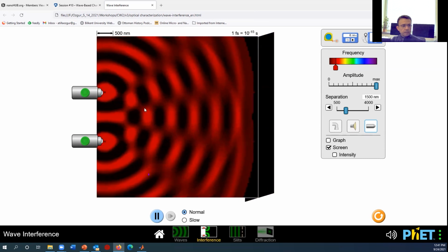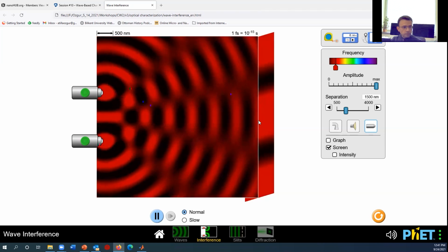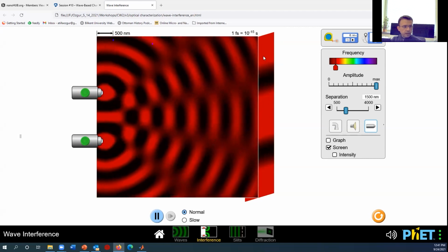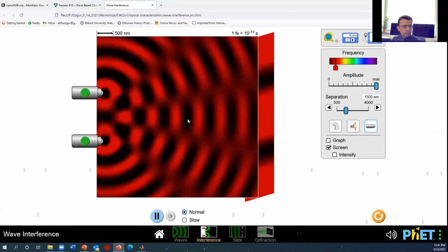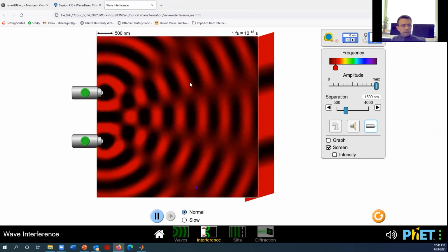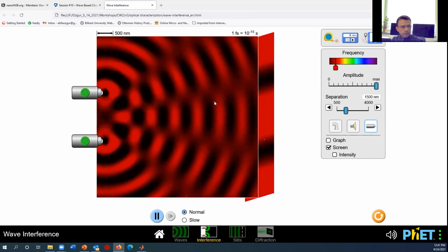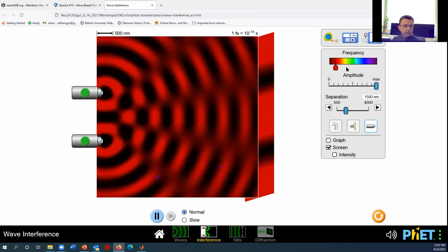And if we bring it back to the red colors, and these diffraction orders, I don't know if you noticed, but it shifted up. So the angle. If we put the screen here, and if this is our axis here, and I take a look at this angle here that I'm describing, I hope you can see it, that's going to be getting larger, right? So as the wavelength is increasing, this interference pattern and these diffraction orders are also getting larger. The angle-wise, they're getting larger. That's one relationship that they can understand.